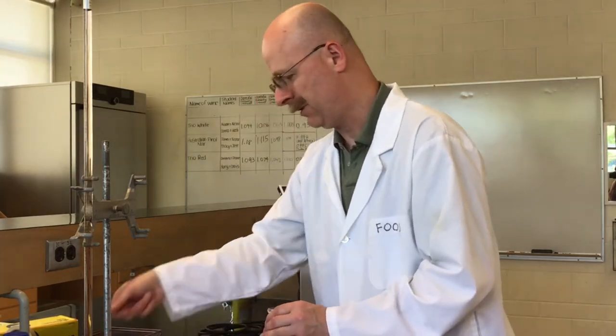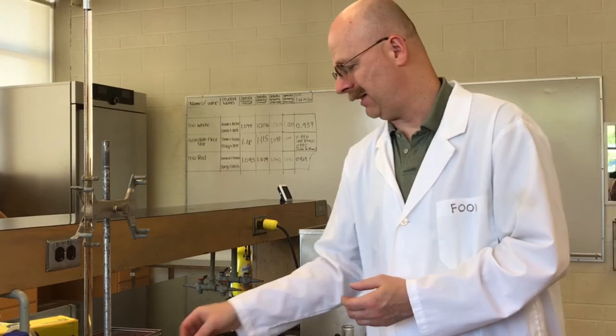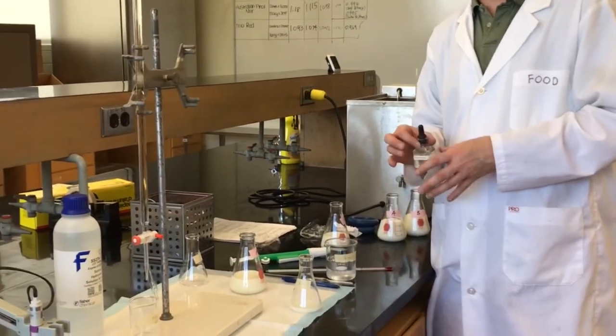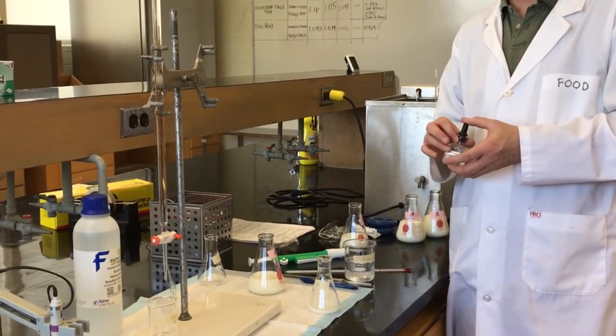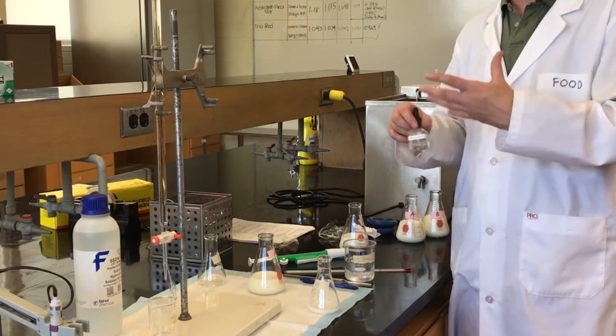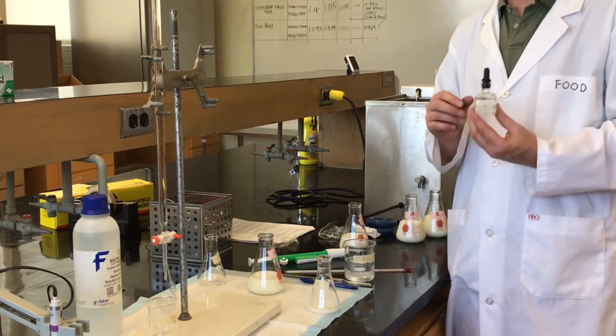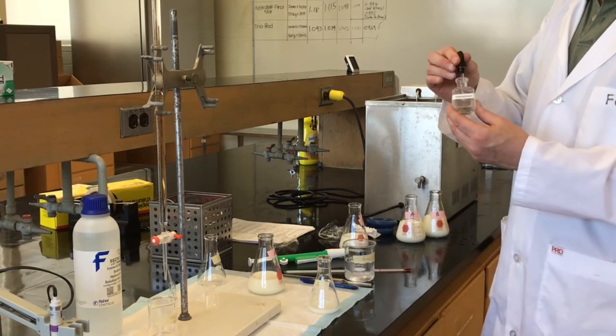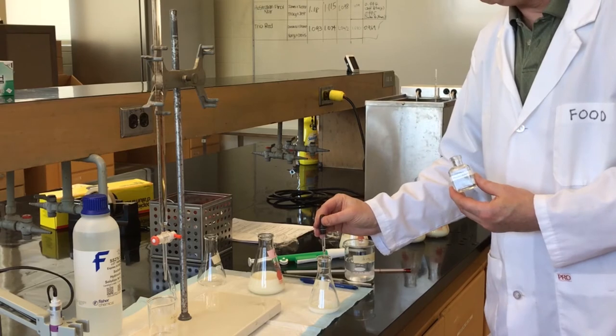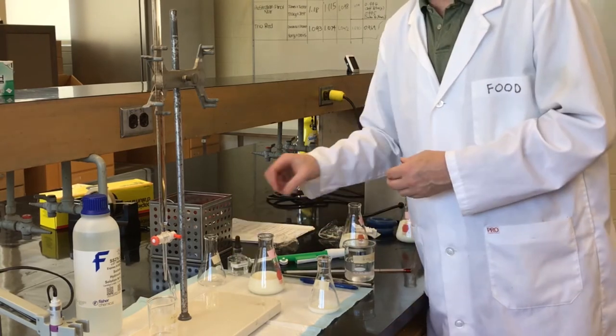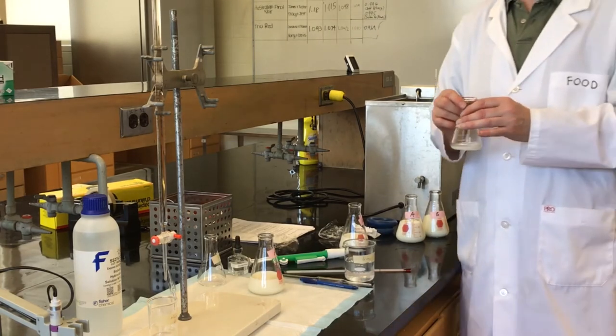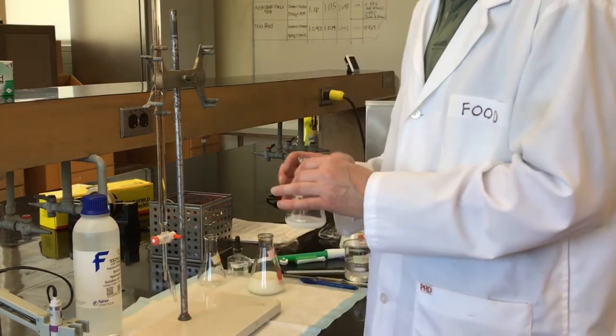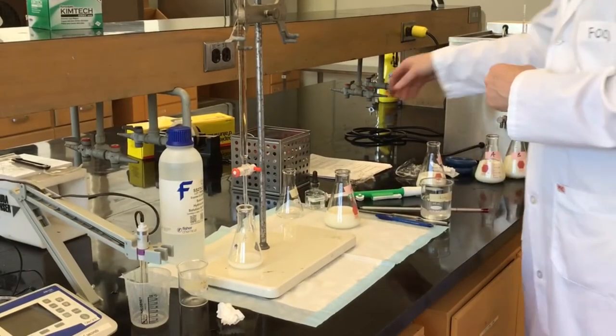Set that aside. So the next thing we need to do is we need to add an indicator. We're looking for a color change. Hopefully you've had an opportunity in some previous life, perhaps in high school, you've done a titration maybe in the chemistry lab. So maybe some of this will seem familiar to you, but we have a product called phenolphthalein. Just don't try and spell it; it's a big long word. This is just going to give us a color change. So just a few drops. Now we're going to titrate our sample. I'll talk a little bit at the end about the difference between pH and TA. Let's for now just go straight through into the procedure.